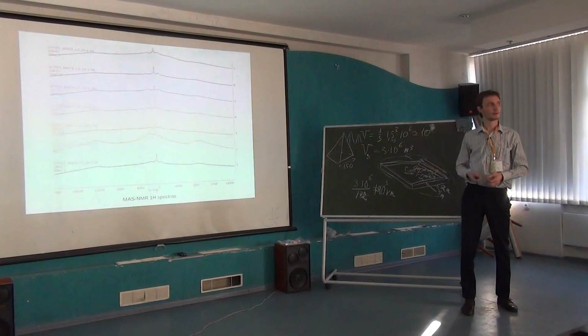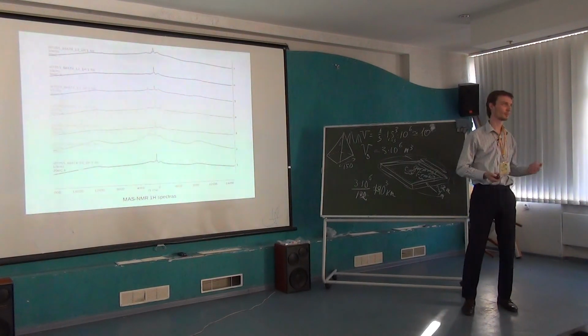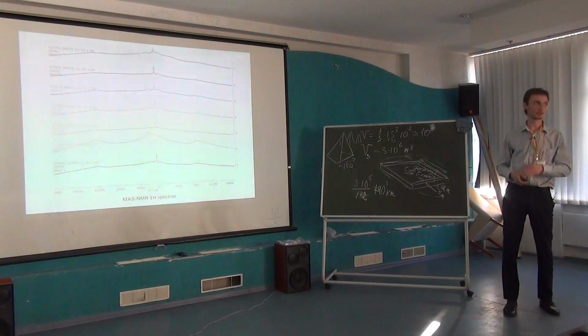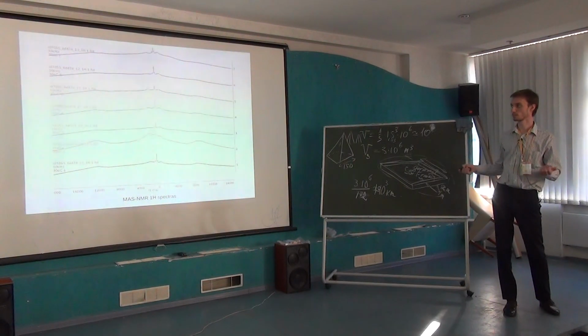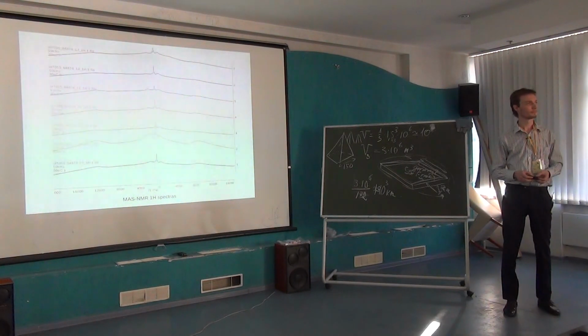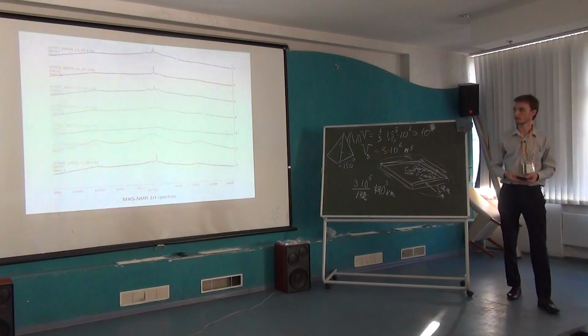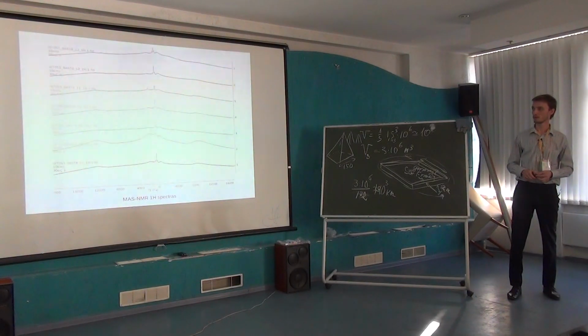Or are the spinning sidebands? The spinning speed was the same. It was 10 kilohertz. The temperature was the same, the room temperature, 30 degrees. It was a very warm room, and the same conditions for the same nucleus. Yes, they do appear at around 10 kilohertz where you expect to see the spinning sidebands. Is that about right or not?